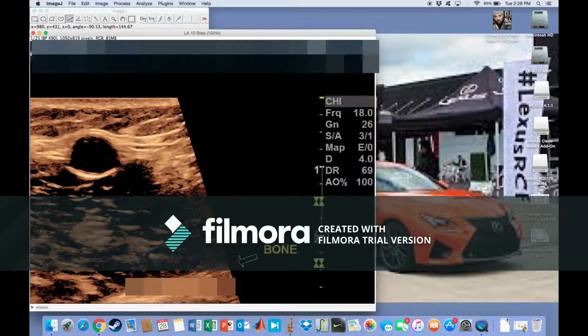And if you can see in the upper corner as well, I am at an angle of negative 90 degrees. That is perfect, so you want to leave it there and release your mouse. And then up here was where it was showing you the negative 90. And you can see here as well that we have a perfectly straight line.